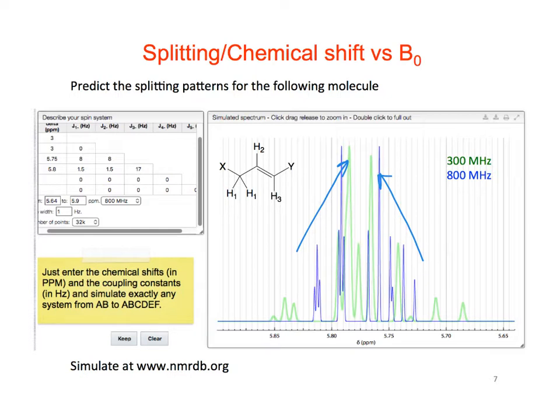And 5.8 is right here, and that's closer to the bigger peak than it is to the small one. But I think from an experimental point of view, at least the way I've always done it, and maybe I'm wrong too, all you can really do is report the average value in the middle there.